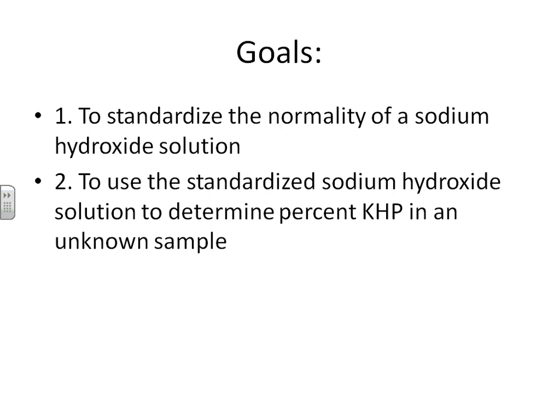You're going to be doing two things. First, you're going to be standardizing a sodium hydroxide solution. I will be providing you with the sodium hydroxide solution. You're going to be getting about a liter of it. This might seem like quite a lot, but we're not only using it for this particular lab. It's a sodium hydroxide solution we'll come back to and use in pretty much any other acid-base lab we do from this point out to the end of the year.